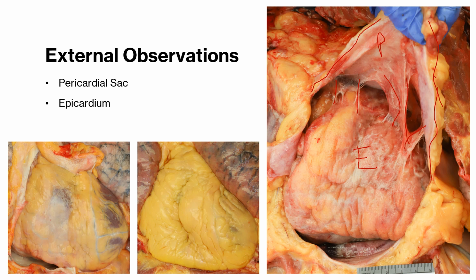And in the heart to the left here, we have this white patch on that anterior surface. And this is just a fibrous patch, sometimes known as a soldier's patch. I don't think the etiology is 100%, or not etiology, but pathologic indications. I think it's associated with a rub between the anterior surface and the pericardial surface, creating this patch of fibrosis, but still something you want to document.